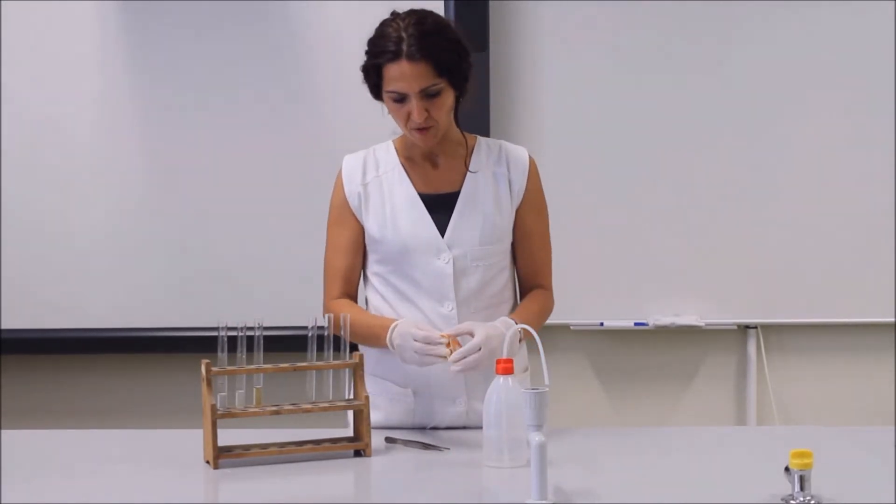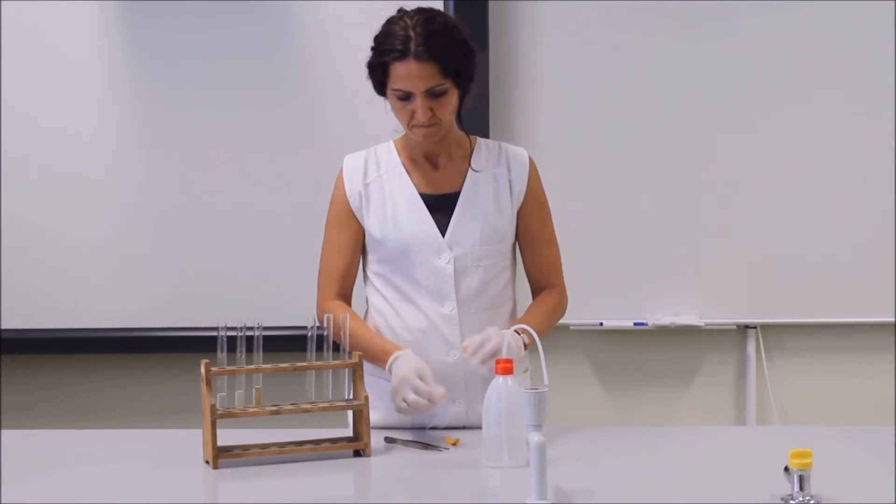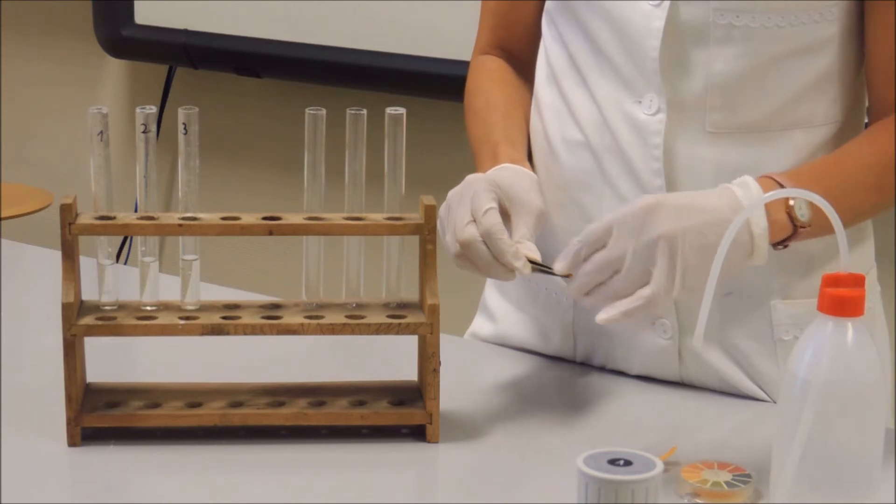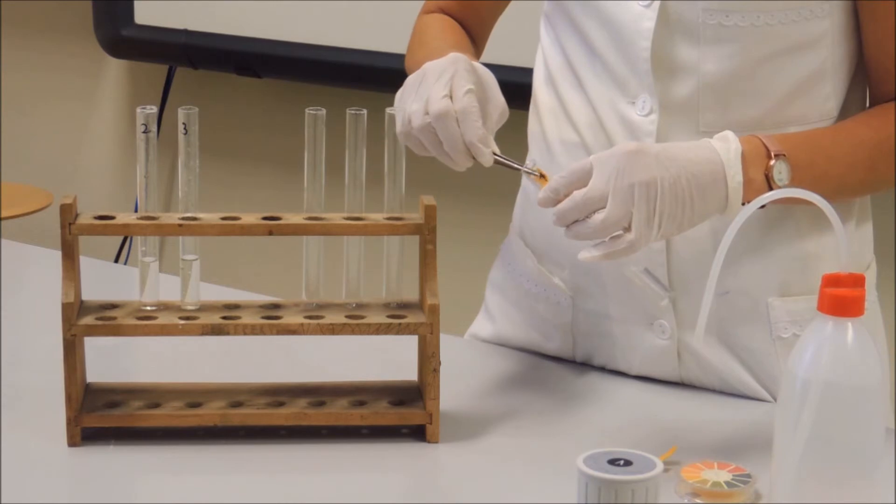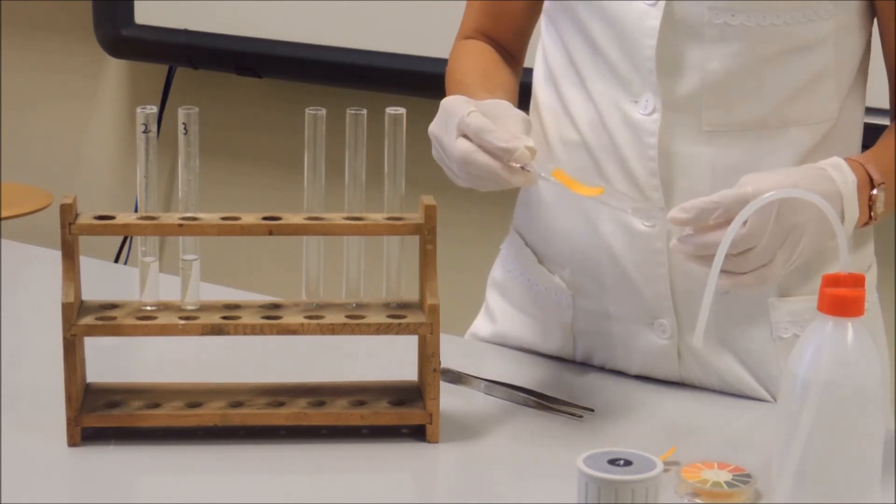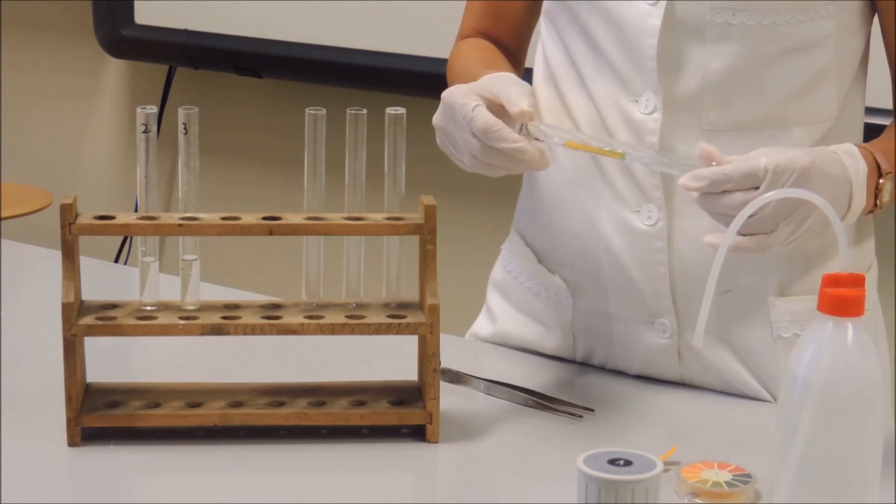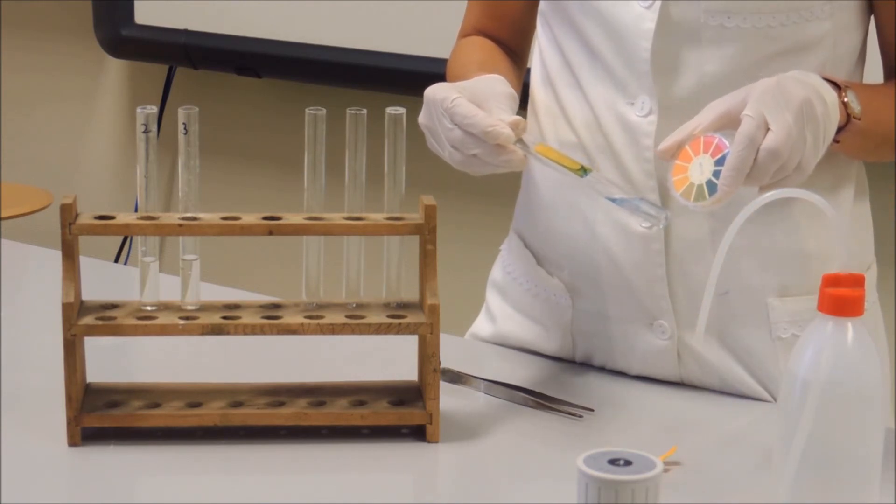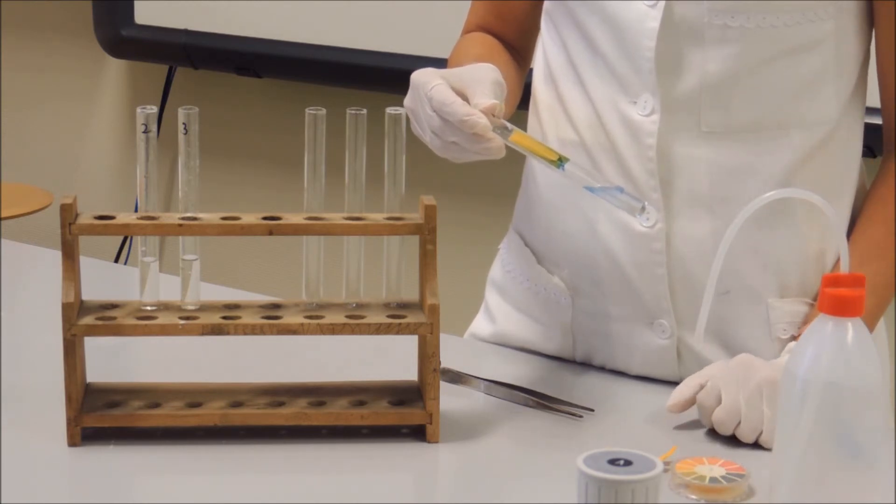We will test their pH with pH paper. Place pH paper in the first test tube. The solution's pH is basic, therefore the first test tube contains sodium acetate.